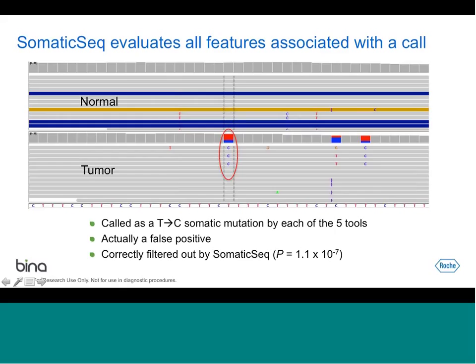The reason is that if you look at the entire read for those variant reads, remember that one of the features we talked about earlier is the number of mismatches. If you look at the variant reads, the first one, besides this one here, you see a mismatch here, a mismatch here, a mismatch at G, a mismatch at C. Here you have 5 mismatches, and 3 mismatches for the other reads. When you look at the reference reads, they don't have those mismatches. So the variant reads average about 3 or 4 mismatches, indicating that they're not correctly aligned.